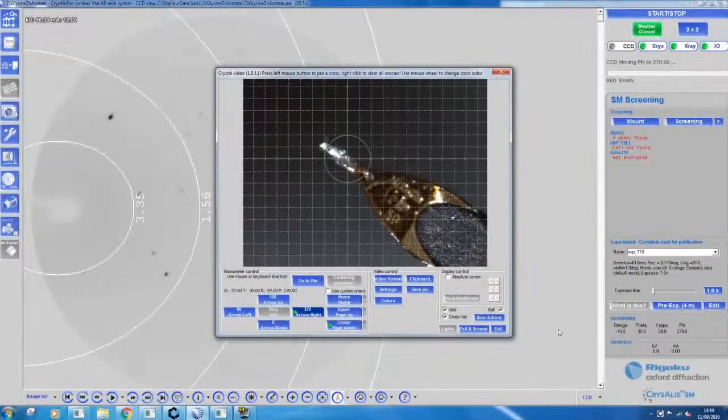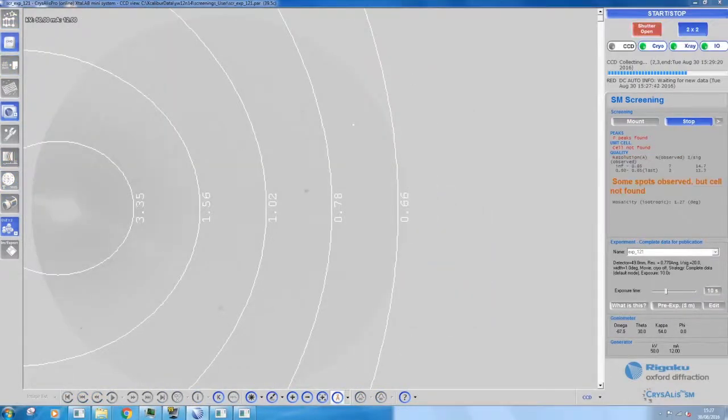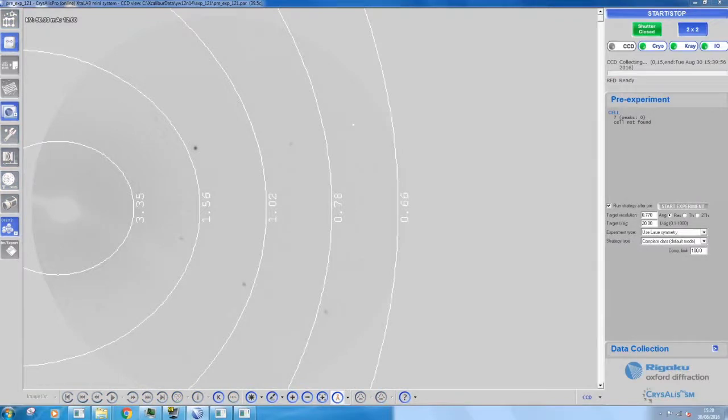Using the screening option in the software allows for preliminary diffraction data to be collected. From the few frames collected, you can decide whether or not the sample is suitable for a full data collection, or if a new crystal needs to be selected. This is a good diffraction pattern. It has spots that are regularly spaced and evenly distributed. The spots should be discrete and circular. A poor pattern could have streaks, diffuse clouds, multiple or split spots. If there are only one or two spots, then the crystal is too weakly diffracting.